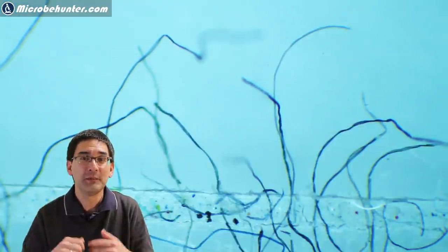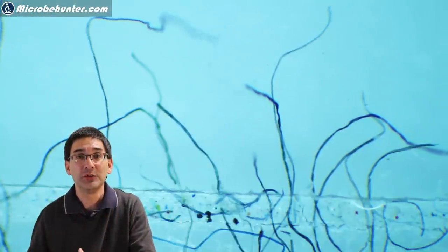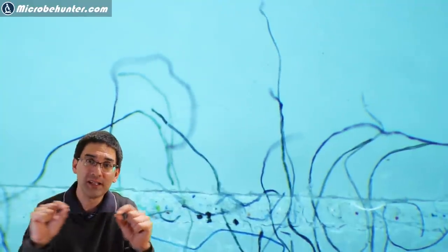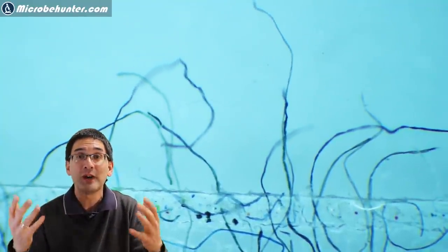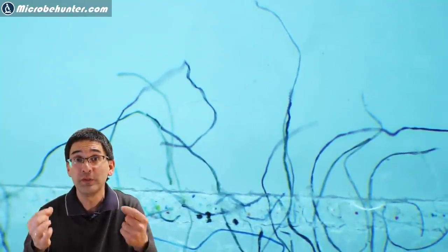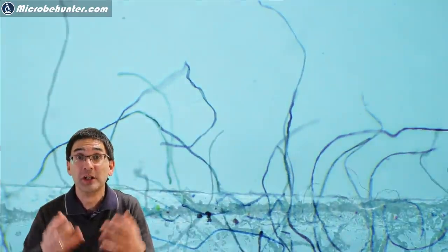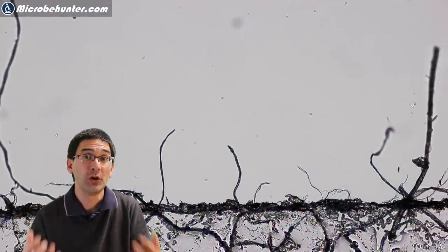Well in any case I've been searching around a lot for interesting places on this tape and I found a variety of different fibers but most of them were actually in dark color.